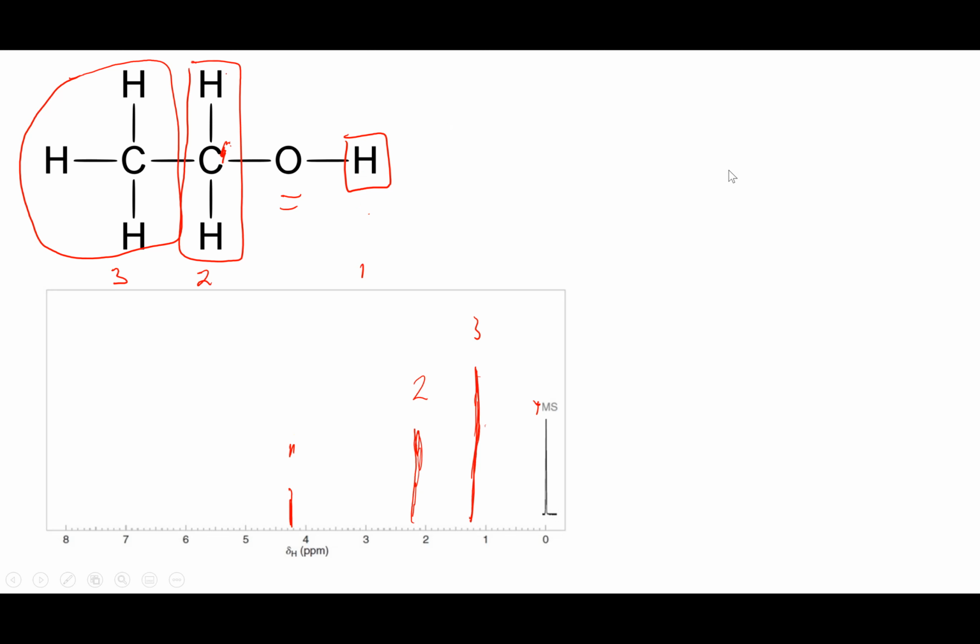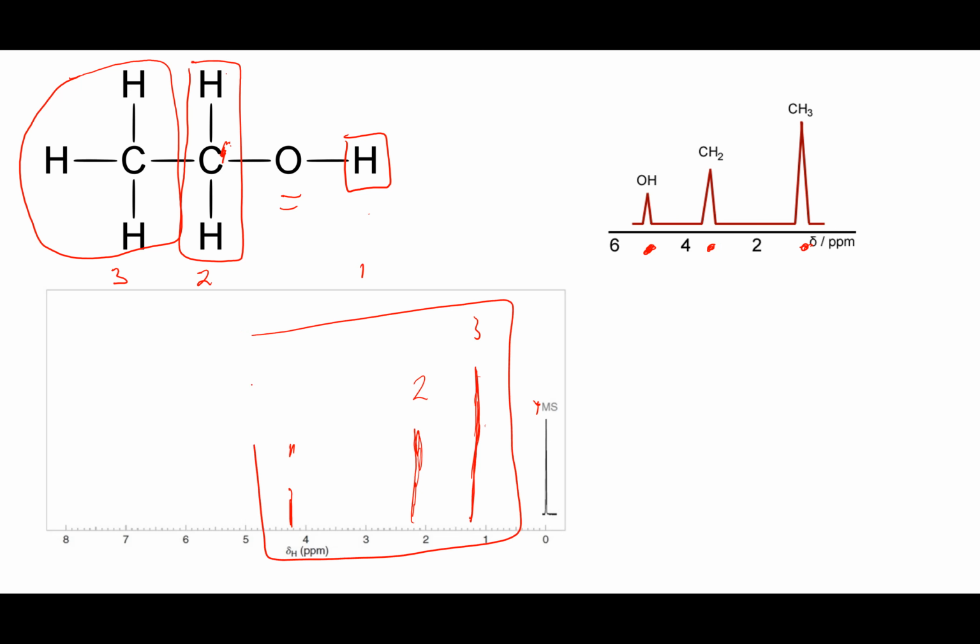Now there is the actual shift that you get from that. So you can see they've put that OH just a wee bit higher. They've got this one up a wee bit higher than I have, and they've got that one left at the same place as it is. That's okay. If I drew this in an exam, going by the values on page 17, that's absolutely going to get me my mark, okay?